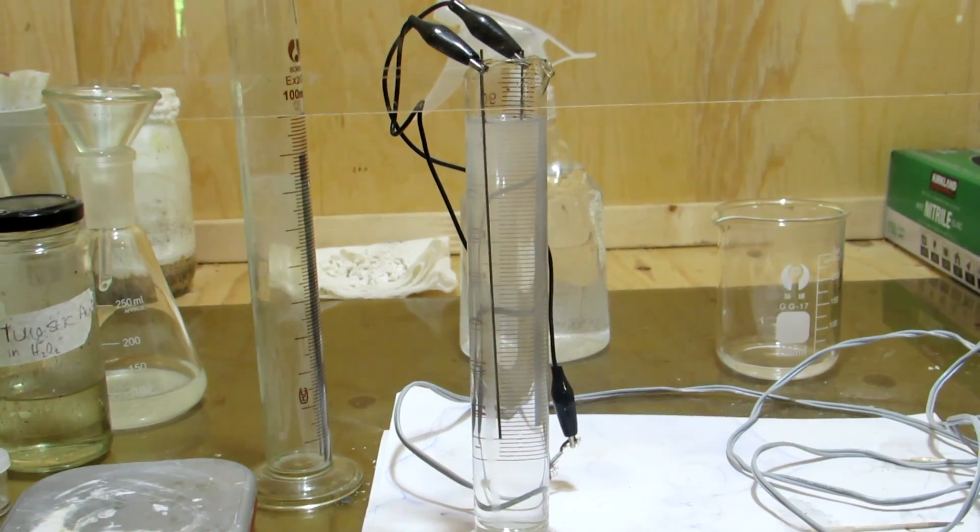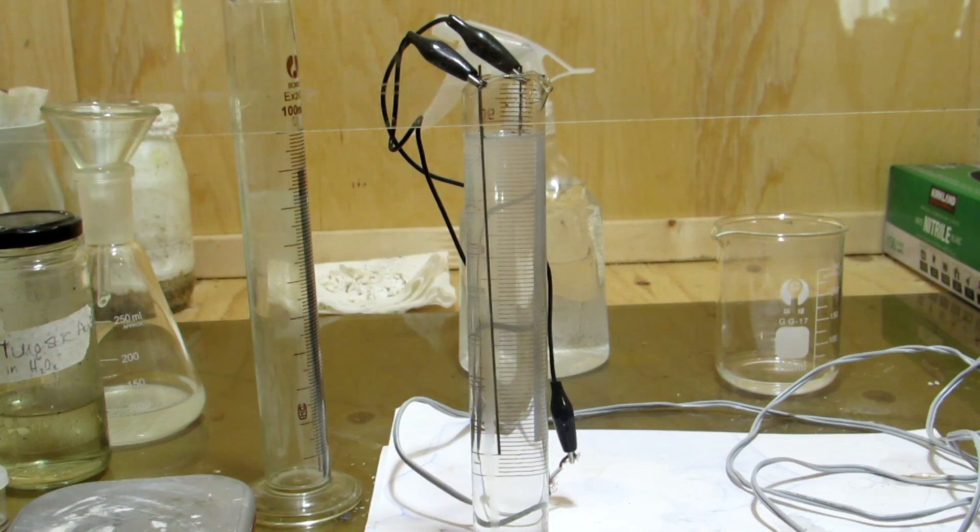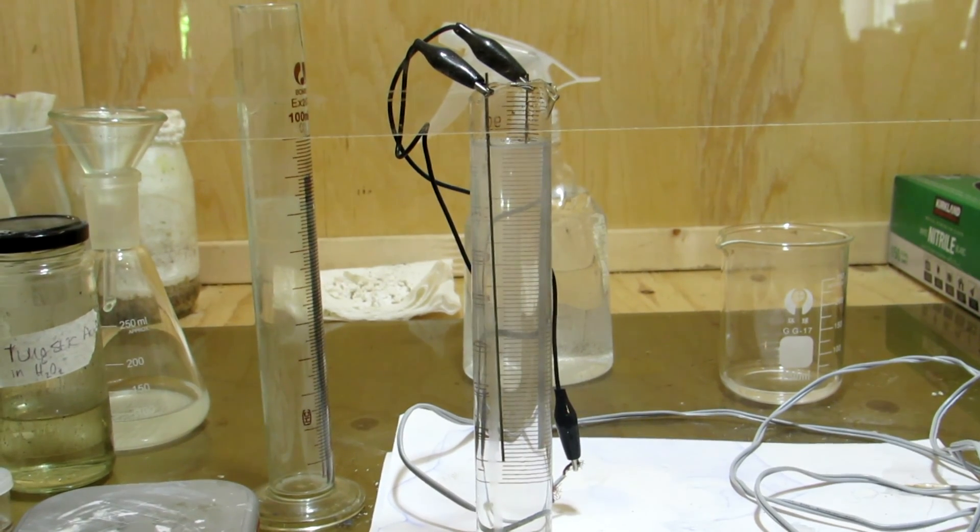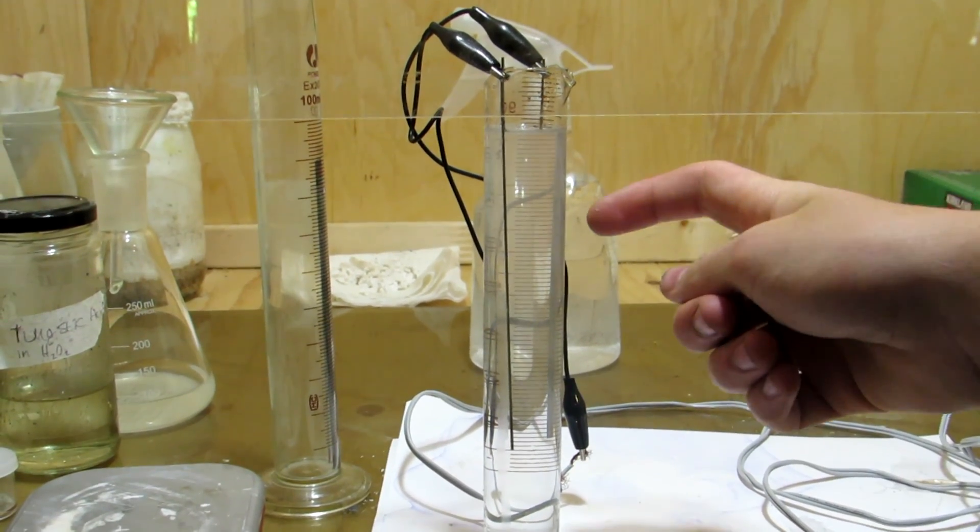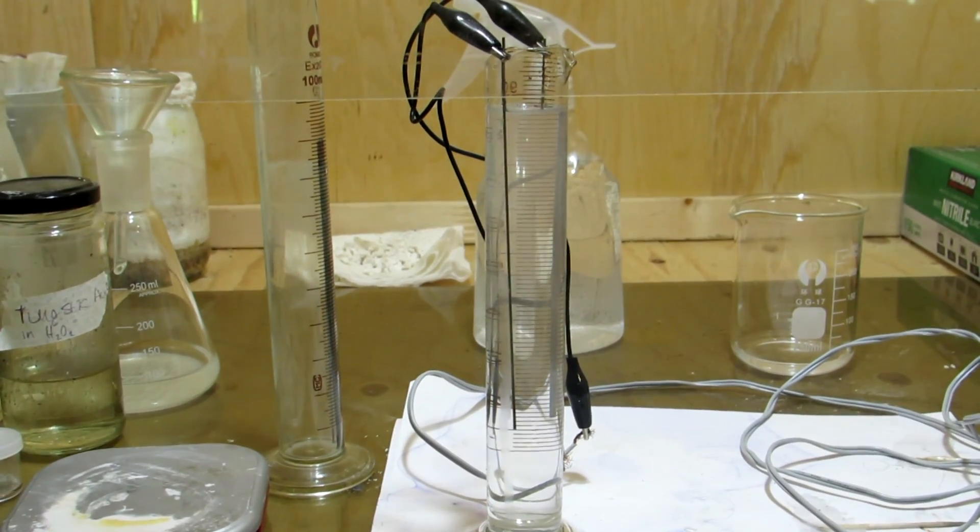To finish processing the rest of the rods however, we will use an electrochemical method to dissolve the tungsten as the hydrogen peroxide is too inefficient. To set up the apparatus, we can first use two alligator clips to attach two tungsten electrodes to the edges of the graduated cylinder.